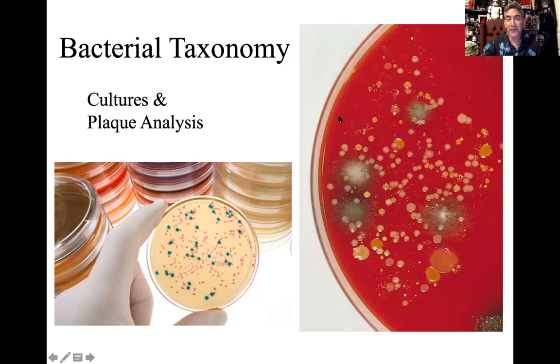Here we call this blood agar. There's chocolate agars. There's different types of growth media. Think of plants. There's different qualities of soil for different species of plants. It's the same kind of concept here. But when they start out, these agar plates are clear. What we would have to do, and if we were in lab right now we would be doing this, I would send you out into the environment around campus.